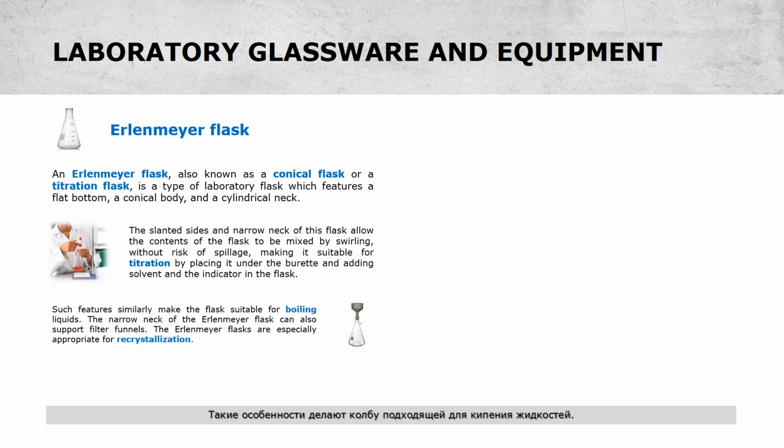Such features similarly make the flask suitable for boiling liquids. The narrow neck of the Erlenmeyer flask can also support filter funnels. The Erlenmeyer flasks are especially appropriate for recrystallization.